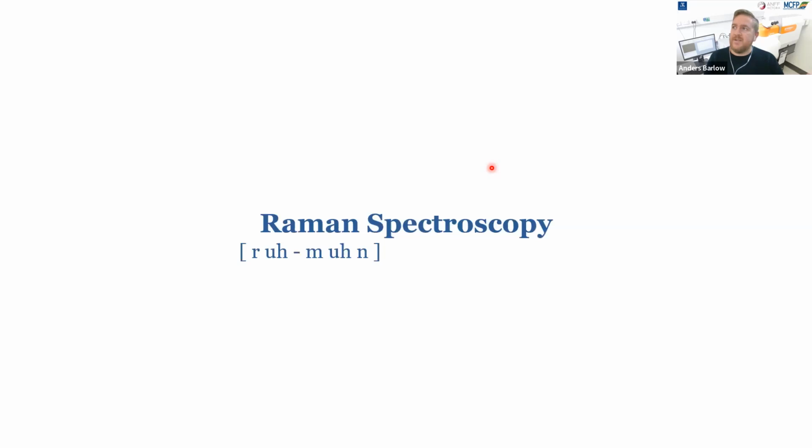Basically, we want to start off talking about Raman spectroscopy and what it is and what it can tell you. So an introduction into the instrument itself. Raman spectroscopy is a non-invasive, non-destructive, label-free method of probing the physical and the chemical makeup of materials. And because of this, it has very, very broad applications.